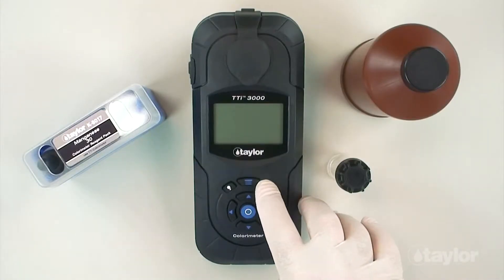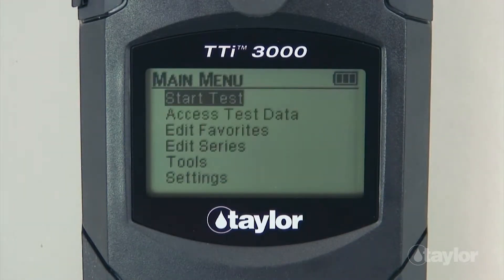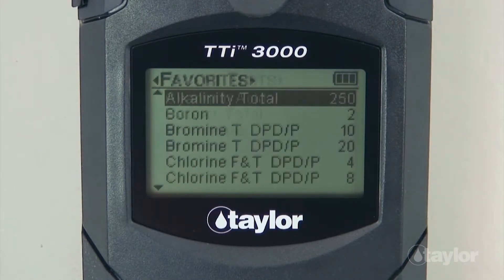To begin, press the power button to turn on the colorimeter. Press the main menu button and select a test menu: all tests, recent tests, or favorites. For this demonstration, we will select the all tests menu, which contains a list of the pre-programmed Taylor tests.